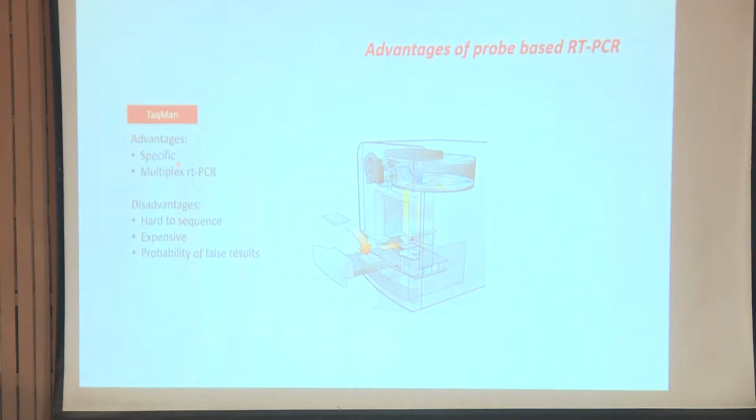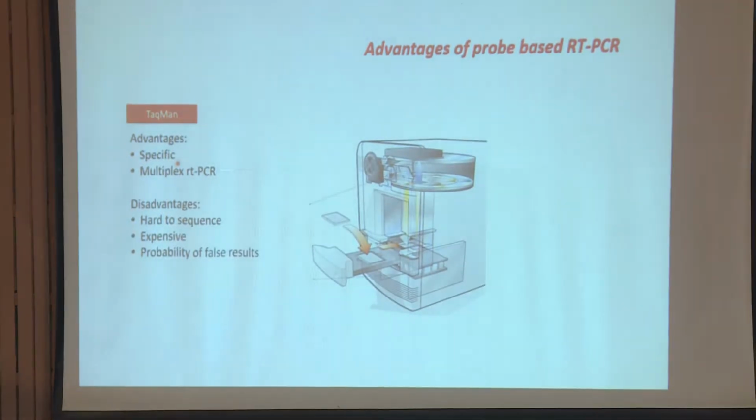What's the advantage? Extremely specific. Suppose your primer fails. It might help, I am telling you. So, it is not the case. Primer should be very specific only, right. So, the point here is, who will help you to design the probe?